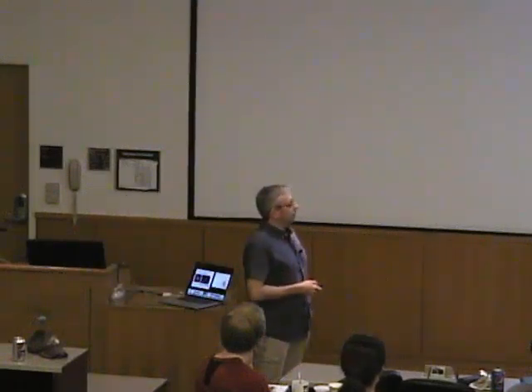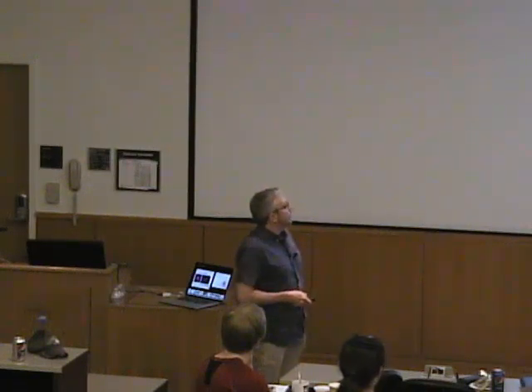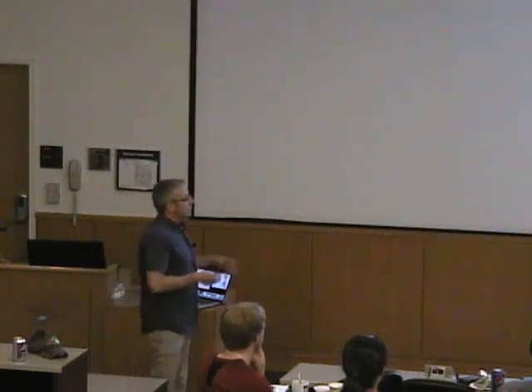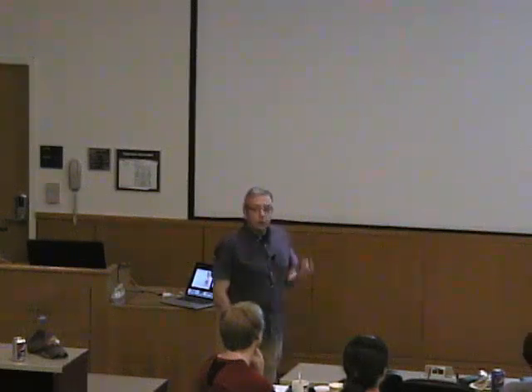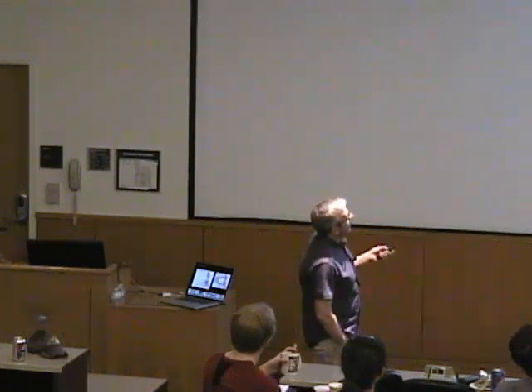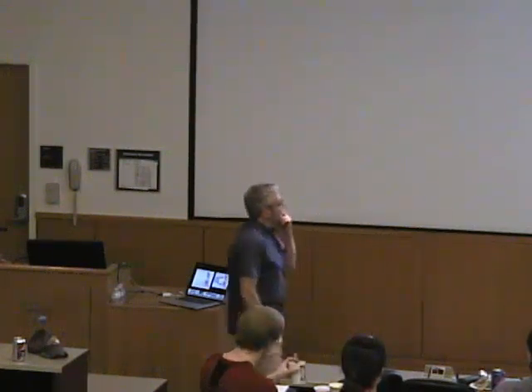Now, anyway, that's not what we're doing. The diffraction data sets that you were looking at in the practicals, or will be looking at in the practicals, just have 180 images, and these images look somewhat like that. And what I want to really talk about from here on is how to get from the diffraction image to what we know as a structure. So these are the kind of things that we publish in papers. This is actually the one that we are solving in the practicals.